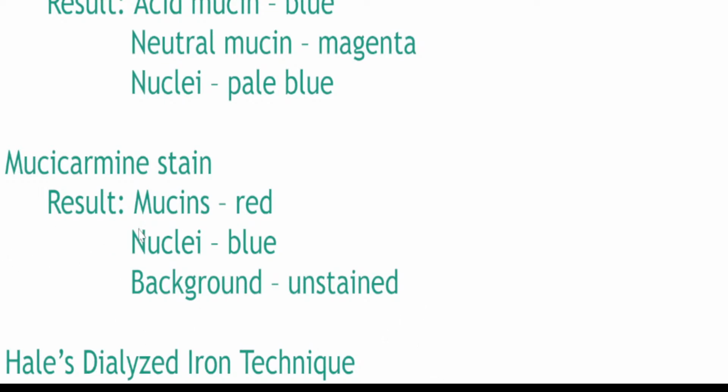So if your laboratory has these types of stains, why do you think there are so many? Do you think they use all of these at once? Actually, some of them they have just to confirm the presence. For example, here in Nebraska Medicine, they use combined Alcian blue and PAS for routine work for the detection of mucins.